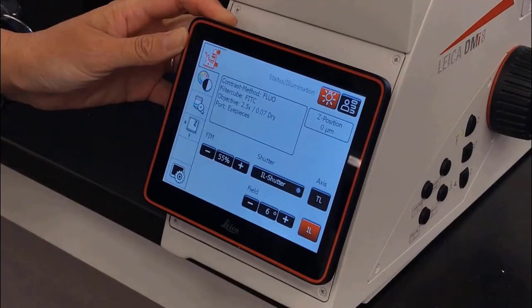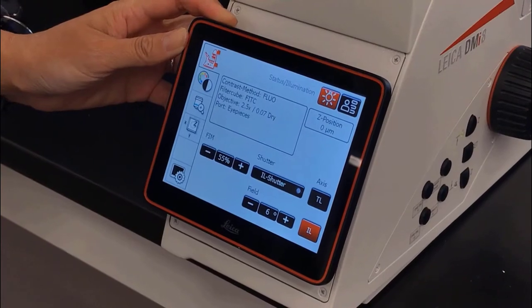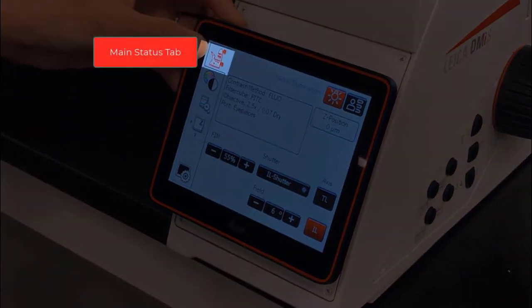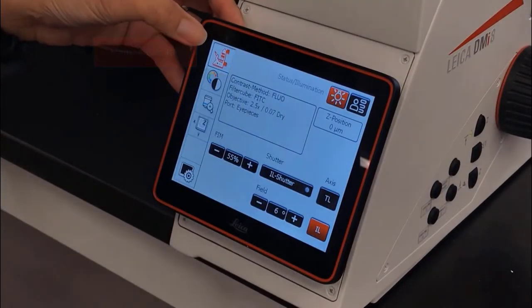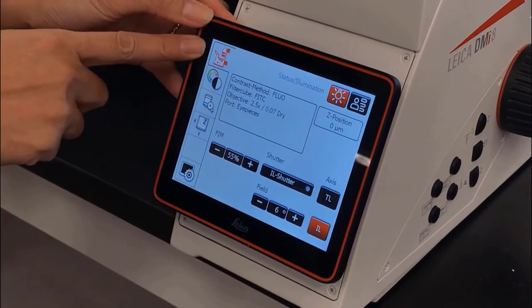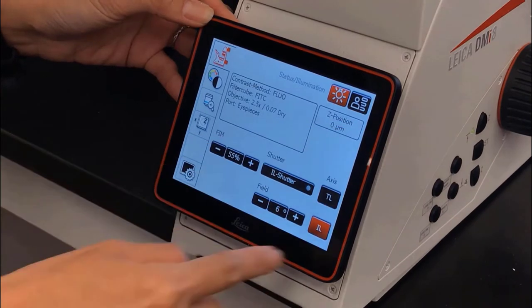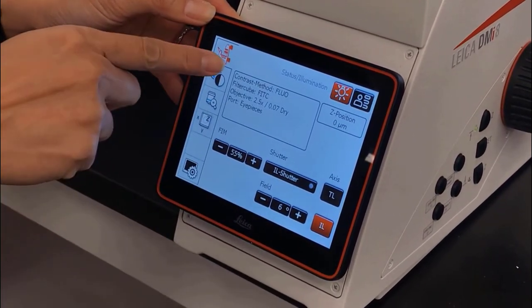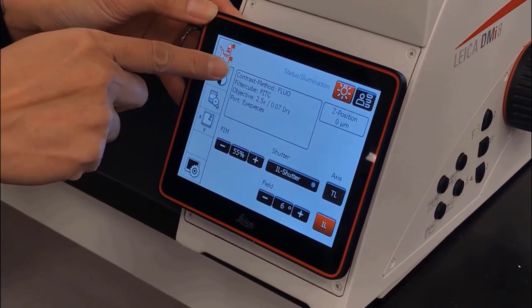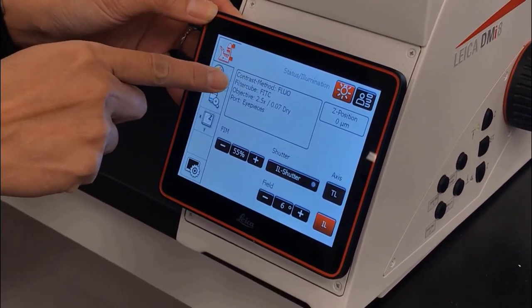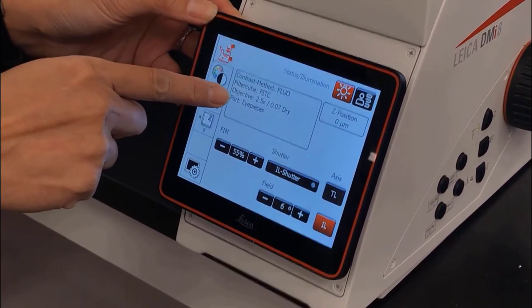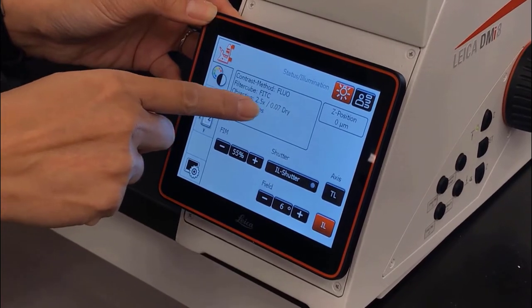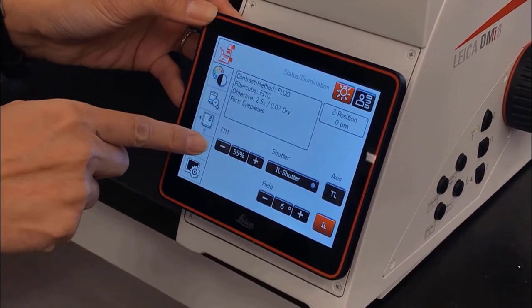In this video, I will go over the layout of the DMI8 touchscreen. The first tab is our status or illumination tab. It shows us a summary of the present state of our microscope, including which contrast method we're in, what filter cube we're using, which objective we're on, and where the light is going.